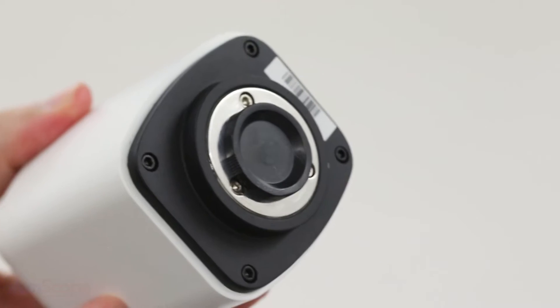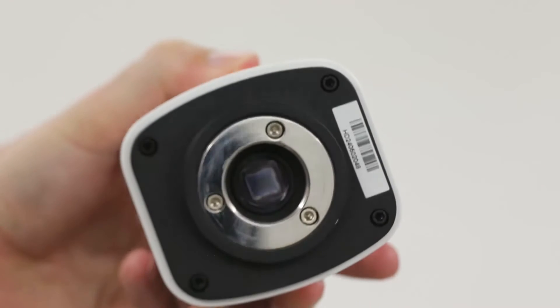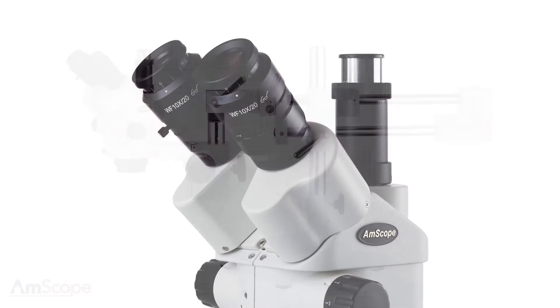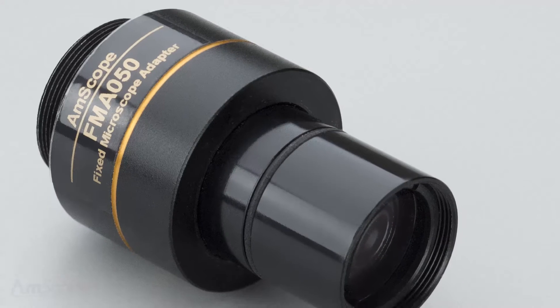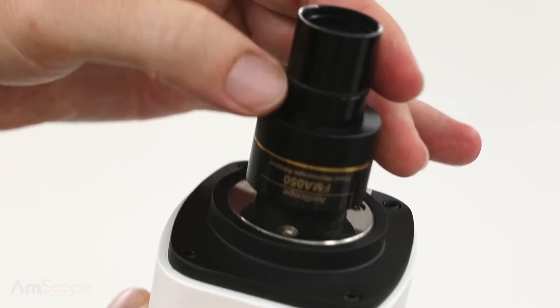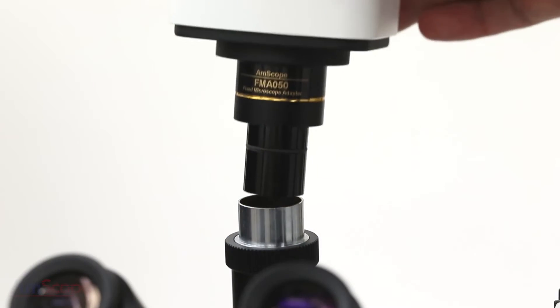We'll start by removing the cap from the C-mount port. If there is a peel-off sticker or film, go ahead and remove it. I'm going to use the camera with the stereo microscope, which has a 23mm drop-in photo port. To connect the camera and optimize the field of view, I'm going to use a 0.5 reduction lens. Simply screw it into the camera's C-mount port, then slide it into the microscope's photo port.